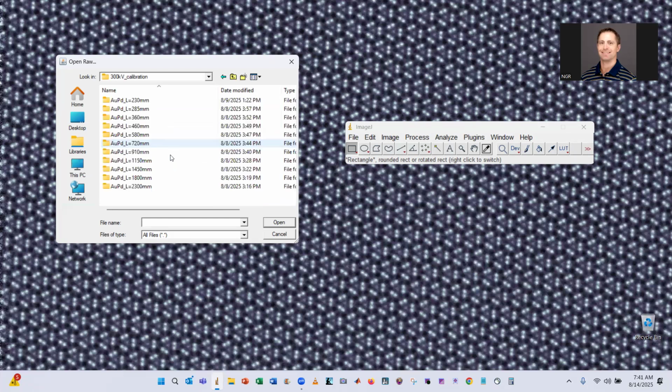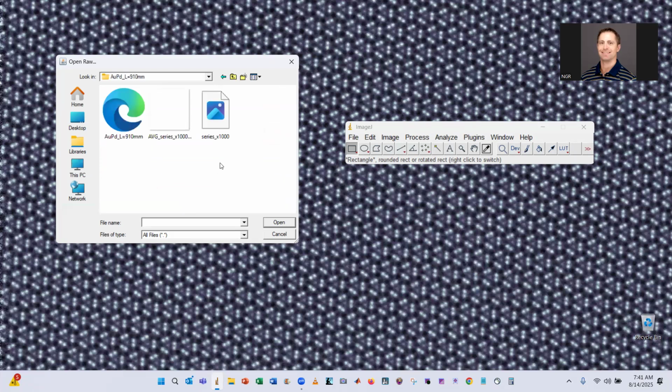So actually, let's start by looking at a series data. This was a series that I took of a DP from the gold palladium sample, and this was with a parallel beam. I actually used this for calibrating the camera length. So yes, you can collect parallel beam patterns with the MPAD if you want. That's not usually what it's used for, but again, the reason I used it was for camera length calibration. So let's talk about how to visualize that data.